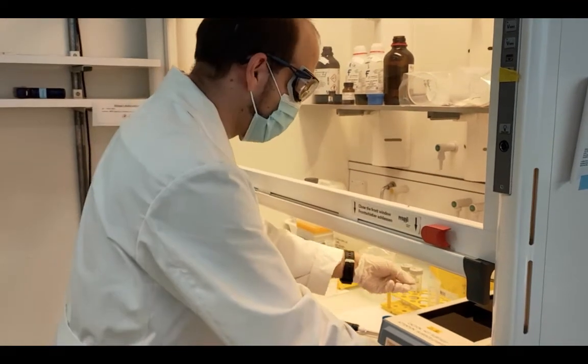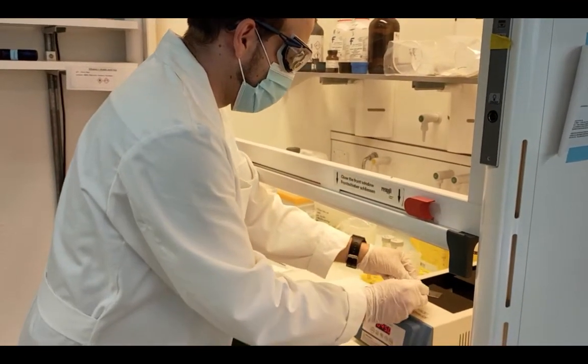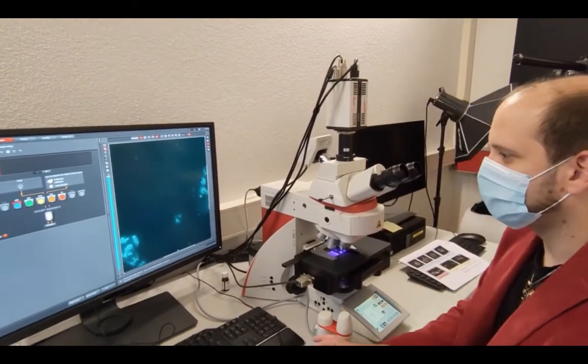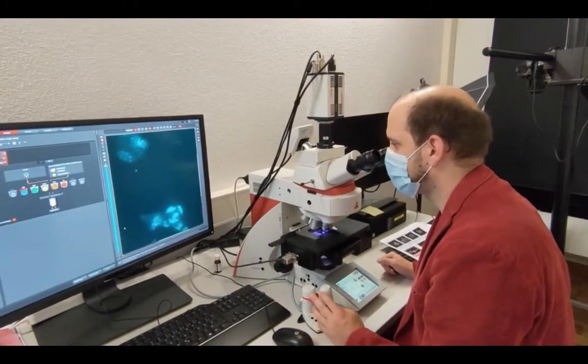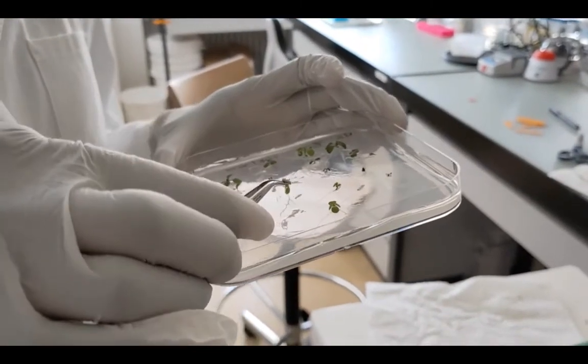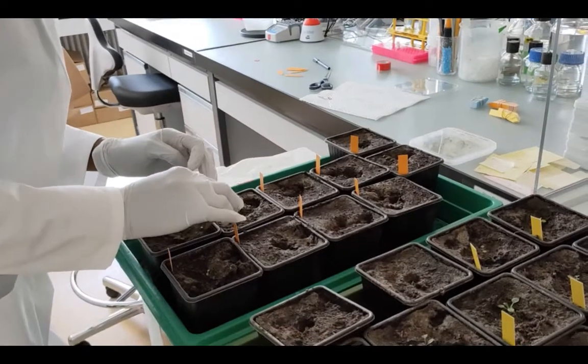And for that, we often have to dissect, either take off the leaves or the flower parts, and then we do analysis on them. For example, we can take out the DNA, and you can look at it then nicely on the microscope. So you take it like this, and take it like this, and then I put it in the pot.